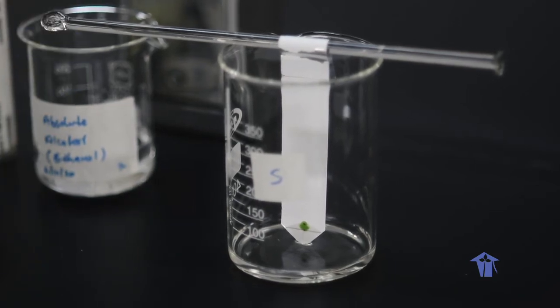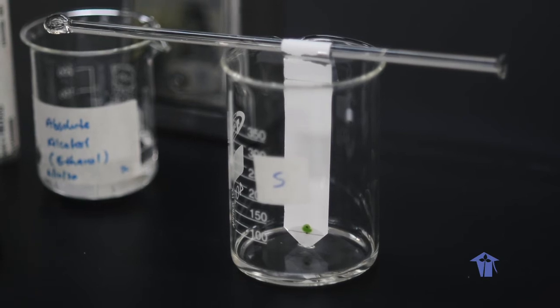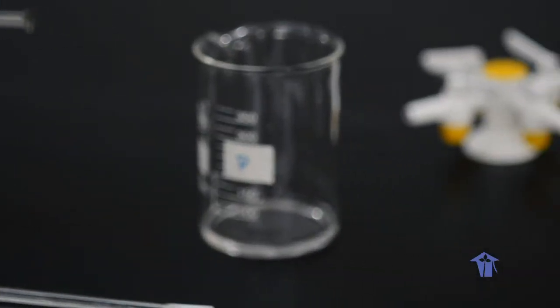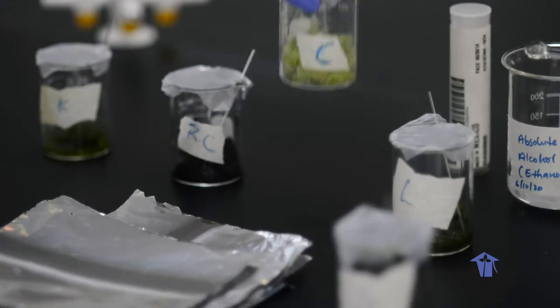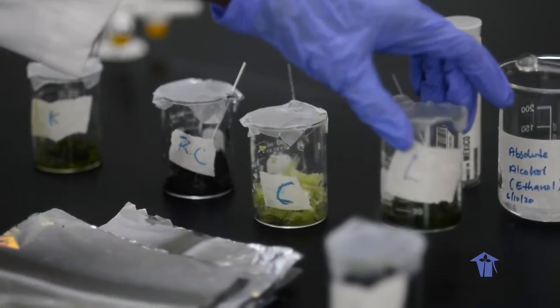What we will do afterwards is to set up the jars for all of our other leaves. We have kale, red cabbage, regular cabbage, as well as lettuce.